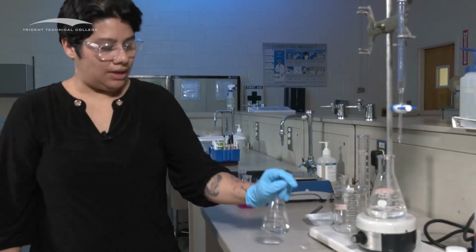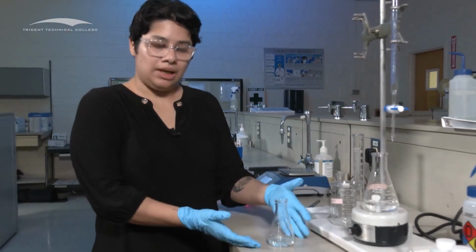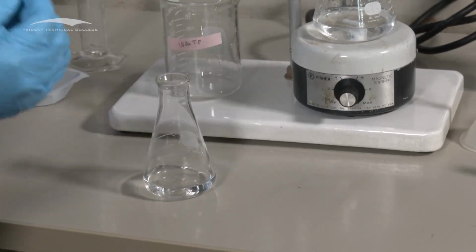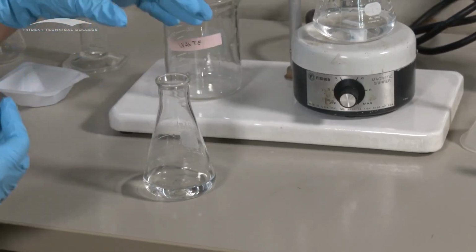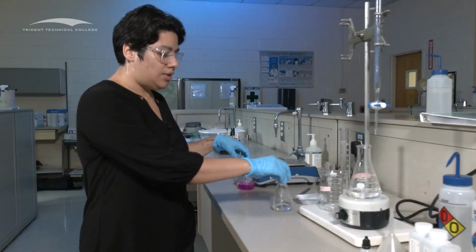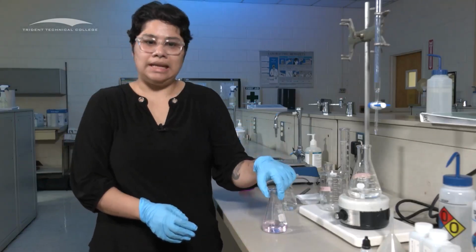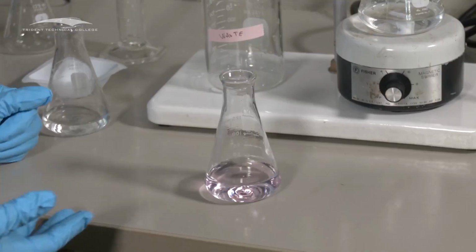You're going to see your pre-endpoint color, which looks like this, and then you're going to start seeing a change, pink by pink a little bit. You're going to start seeing a couple pink drops. And then once you hit your endpoint, which is when you neutralize, when you stop, it should look like a very faint pink, like this.